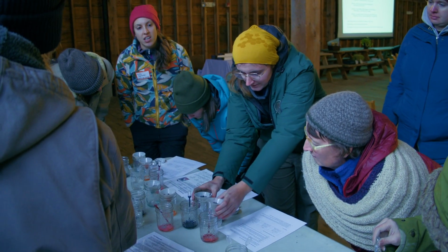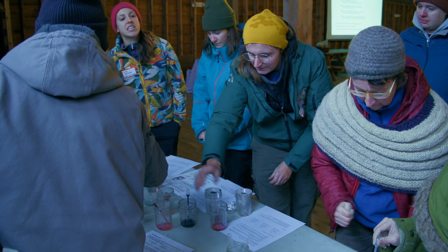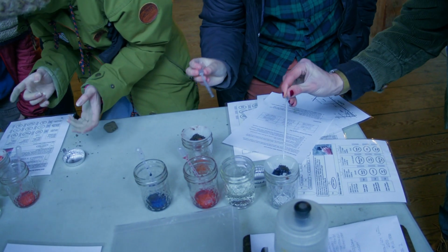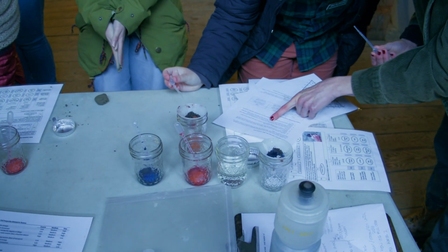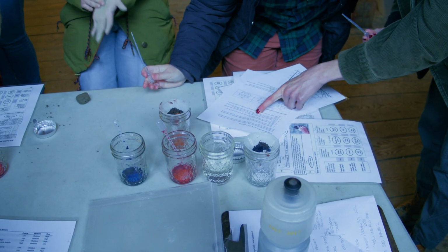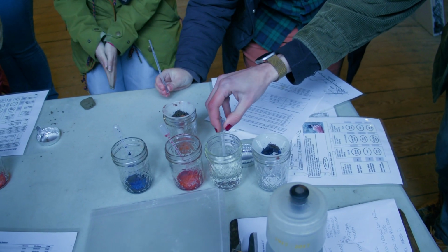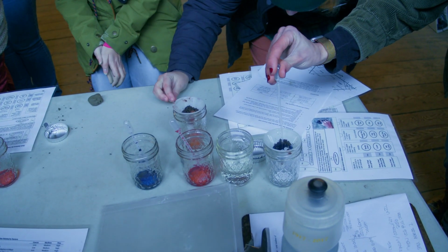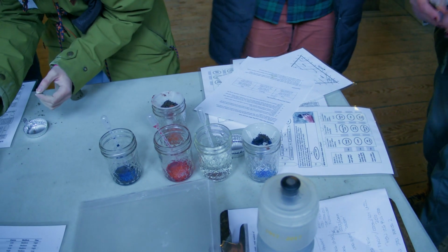The thing that's kind of helpful is if you see a group that has a different texture of soil, it's going to take a different amount of water. At some point, it just doesn't go. I think you're getting some dye. Maybe that was already in there before, the soil contains some dye. Okay. For the volume of water, I probably went too far. Till it starts running.